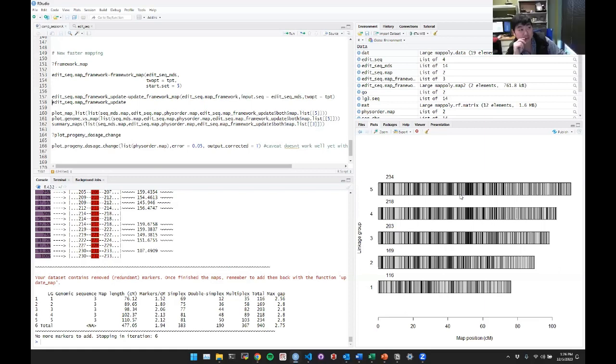Good question. We haven't run a data set yet with a phased genome, and I know you have a phased genome, so you might be able to do some tests and try to figure out the best way to go. And I think yours is also sequencing based markers.